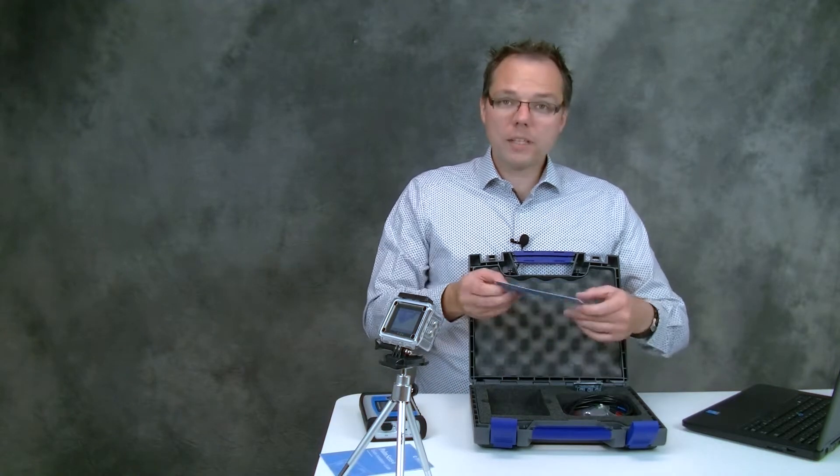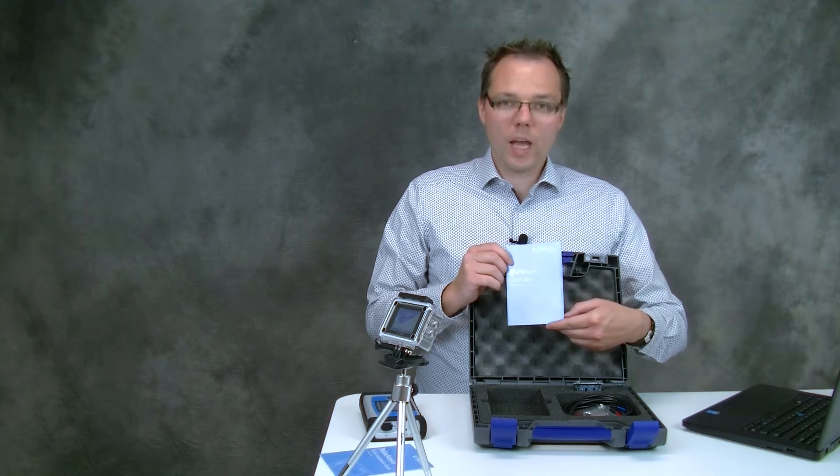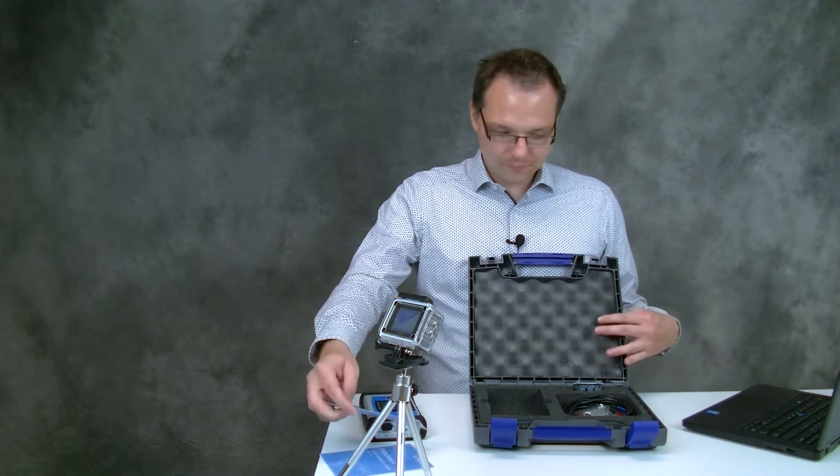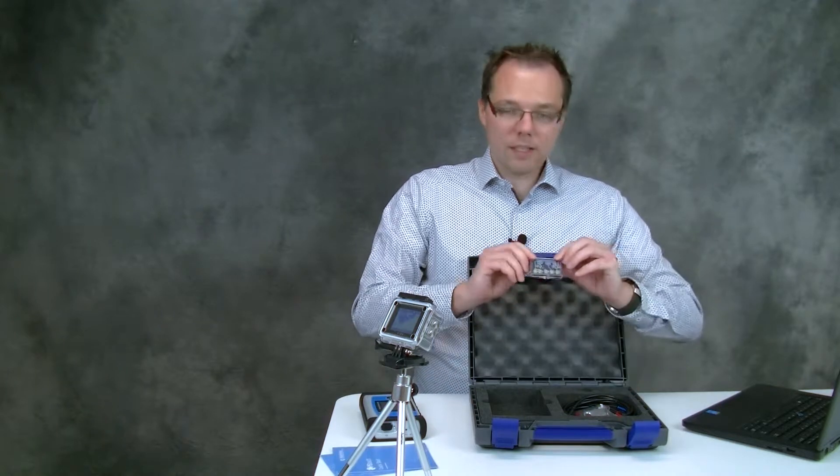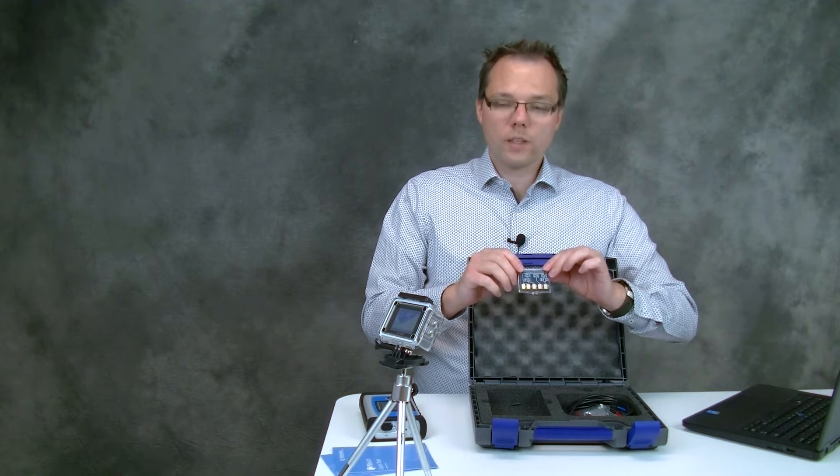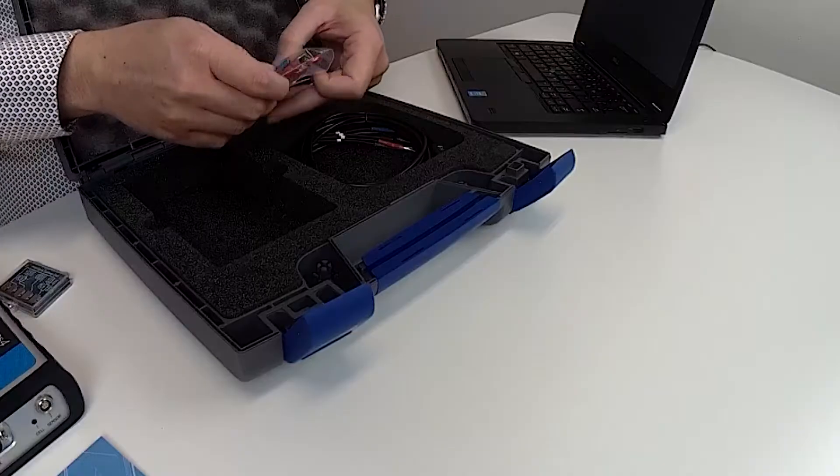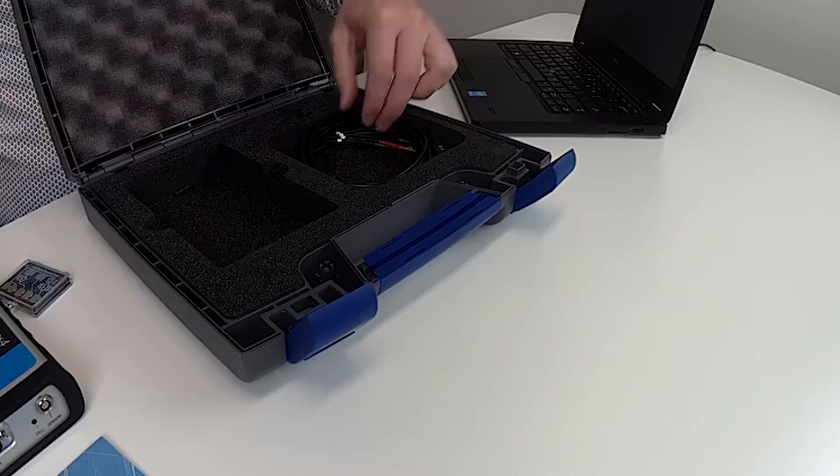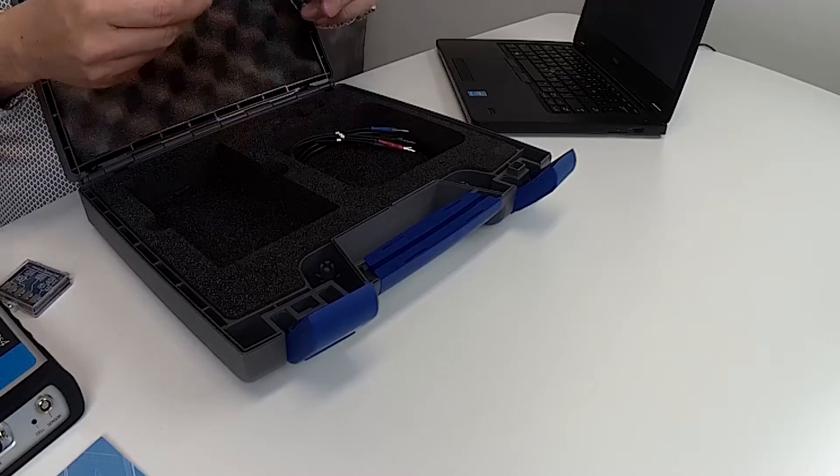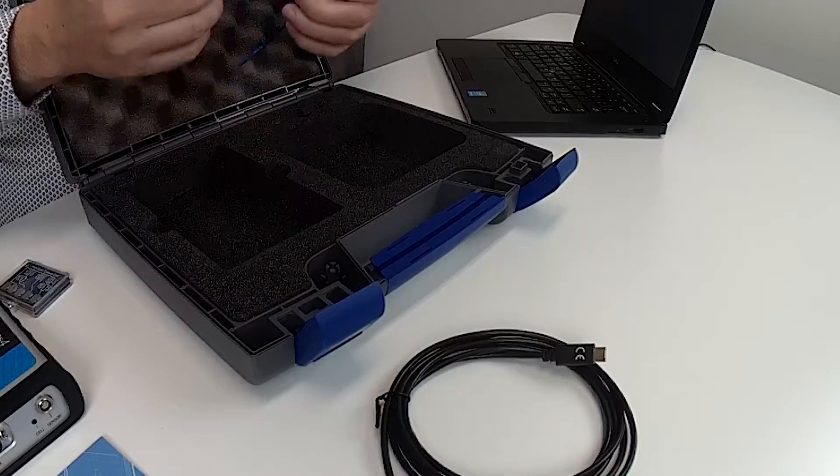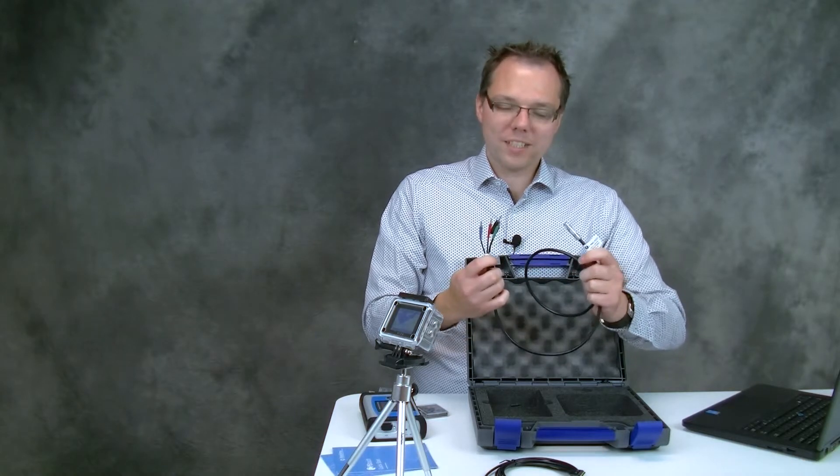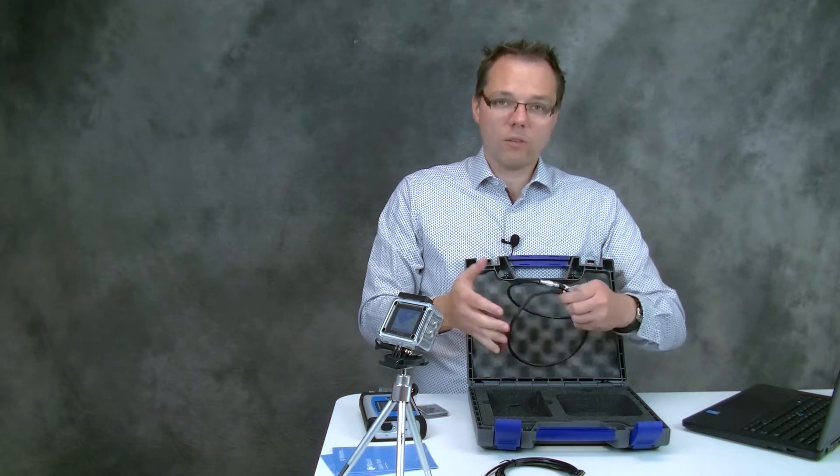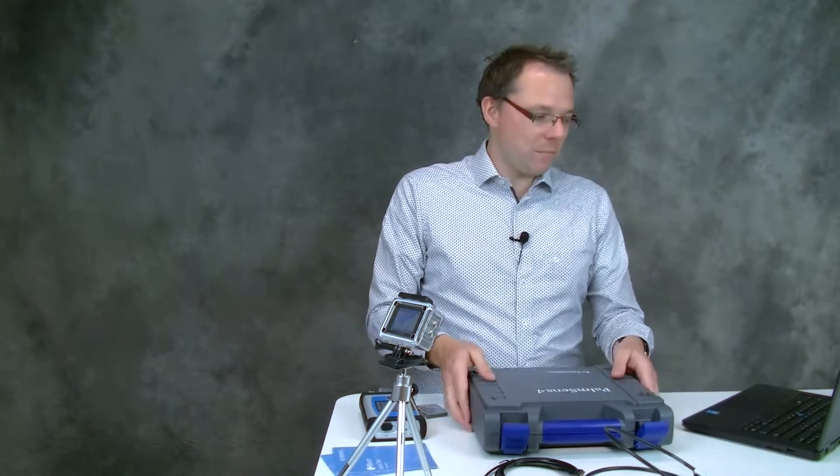Then you also get a PS touch quick start in case you want to use your Android device to control your potentiostat. You find in there a dummy cell with three different circuits that we're going to use during this demonstration. You will find in there crocodile clips and a USB stick, a USB-C cable and our sensor cable for connecting your electrodes or in our case connecting the dummy cell later. This is all you find in the box.